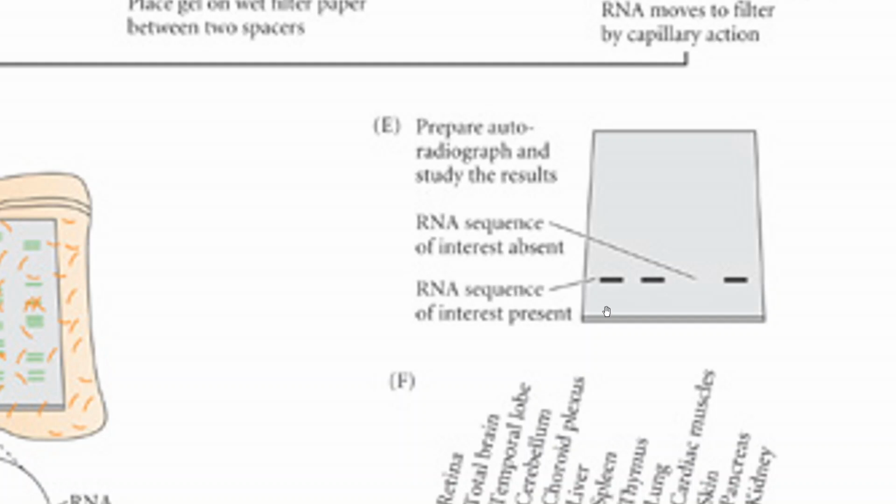The other thing that we know is the size of the messenger RNA, because if that's the top of the membrane, it means this is the top of the gel, right? So the messenger RNA molecules that are large exist right here, and the small RNA molecules exist in this region right here.